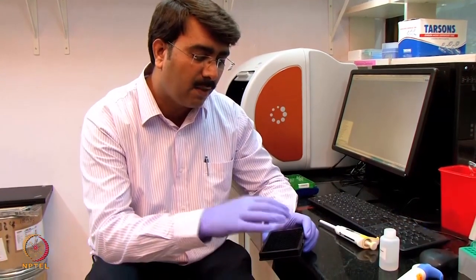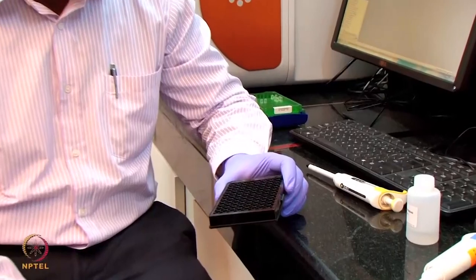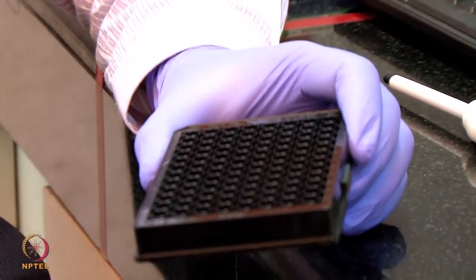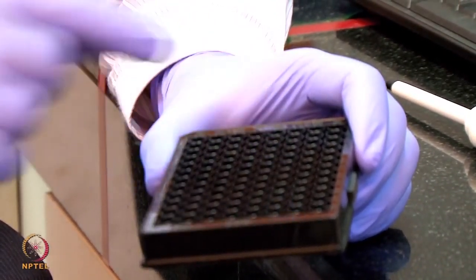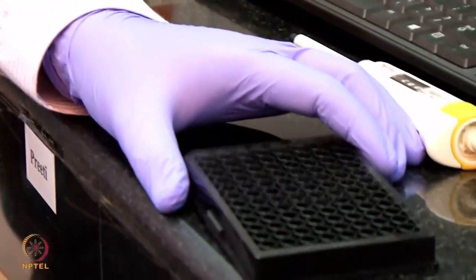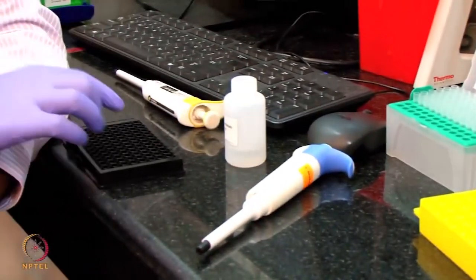So now we have made 6 concentrations of the standard apolipoprotein, ranging from 1.56 to 50 microgram per ml. I had put these standards, from 1.56 in A3 till A8, the last being 50 microgram per ml. As well, I had put the reference buffer, the buffer we are using for reference subtraction, at B6, B7 and B8. Now I am going to add the unknown samples. We have 3 unknown samples here, so I am going to put them in B3, B4 and B5.